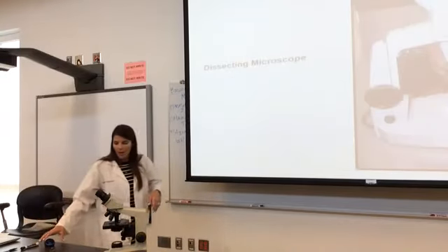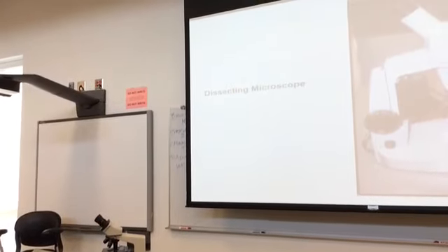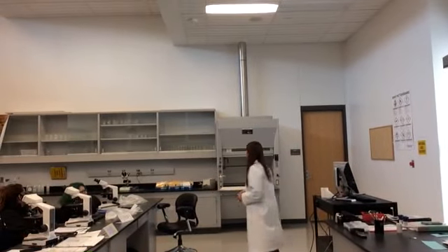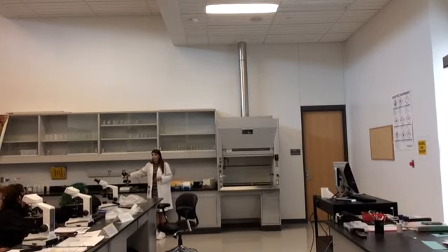All right? Now, over here is our dissecting microscope. This dissecting microscope is a microscope that you are going to have to be familiar with. You will use it in the lab, but this is not a microscope that uses microscope slides. This is a microscope you use, and it's set up differently, okay, when you're looking at something that is not microscopic.